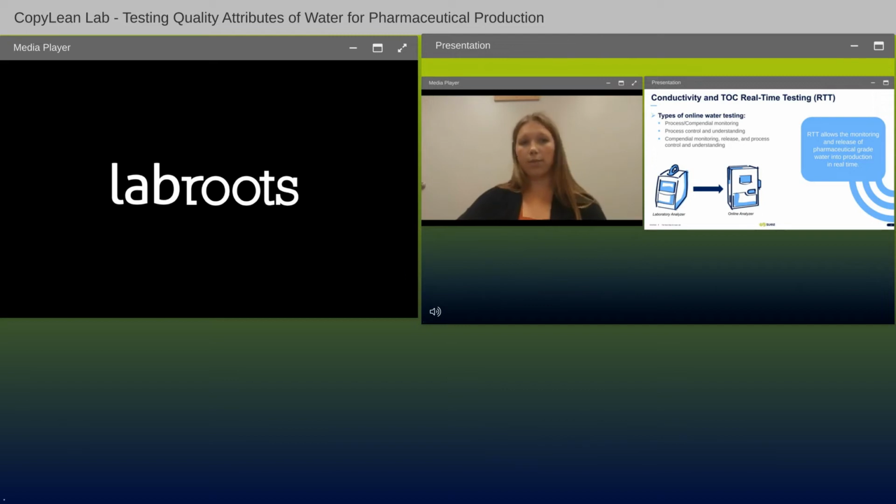RTT, or real-time testing, is the practice of using online instruments for all 3 applications. This requires additional validation, but that inherently improves confidence in all 3 ways to leverage online instruments, beyond just real-time testing's ability to optimize efficiencies.